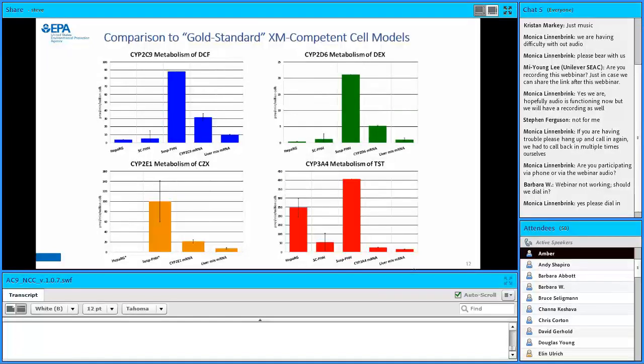No one else does. Actually, no one in their right mind uses DMSO to solubilize their substrates for CYP studies, because it's largely known to inhibit CYP activity. However, we wanted to do these LC-MS studies under conditions that we would be using for high-throughput screening. It didn't seem to make a lot of sense to test our system under some sort of Pollyannish conditions just to see how well we stack up against primary human hepatocytes.